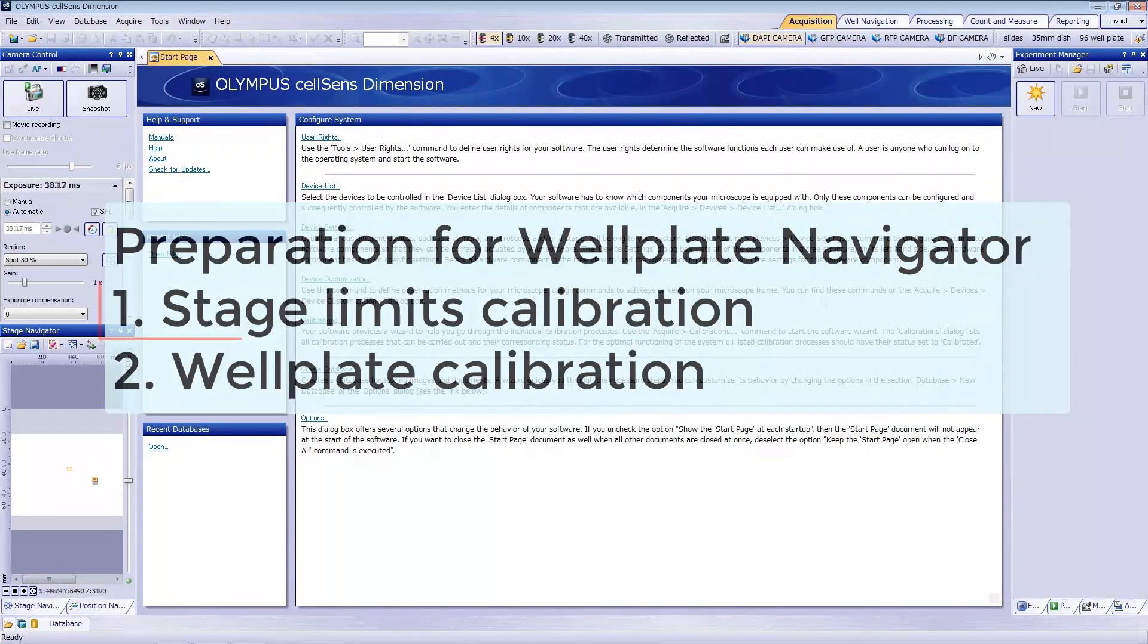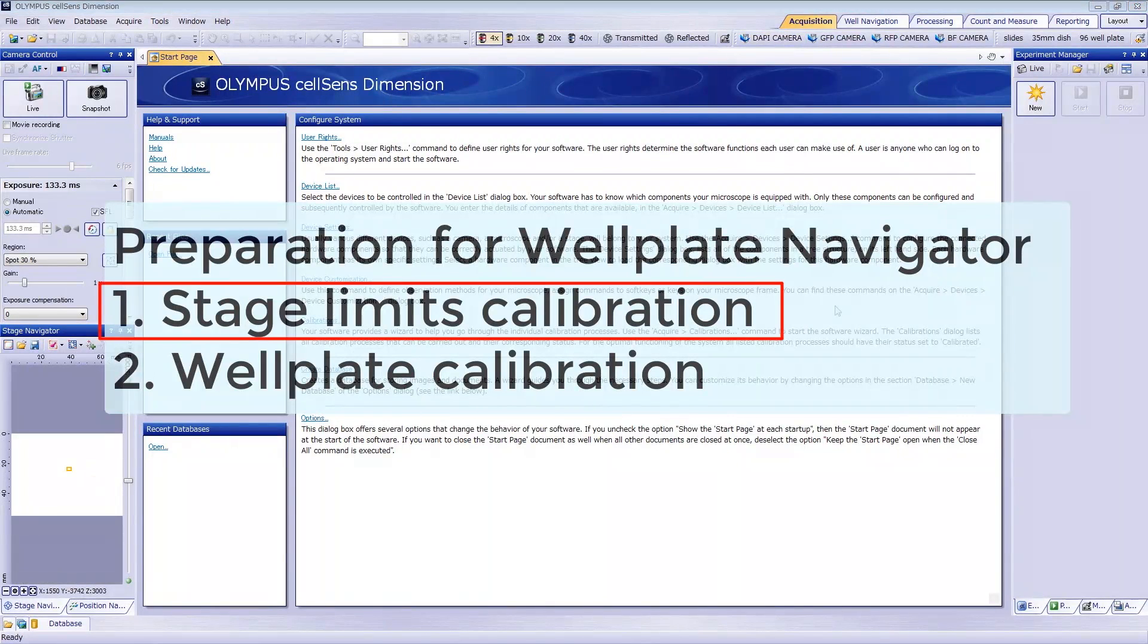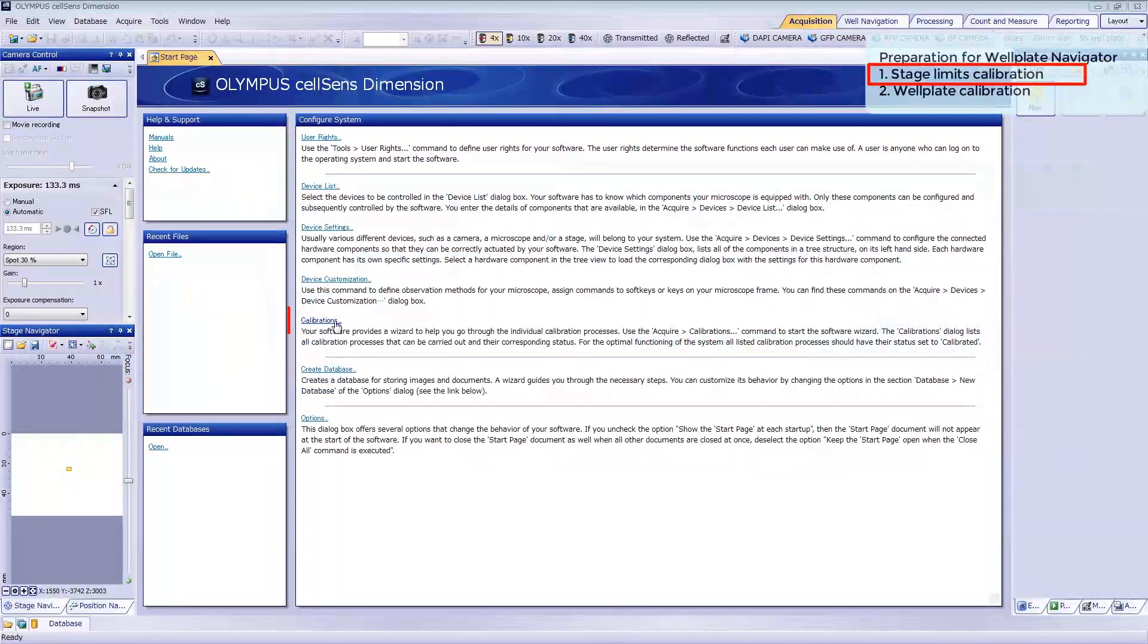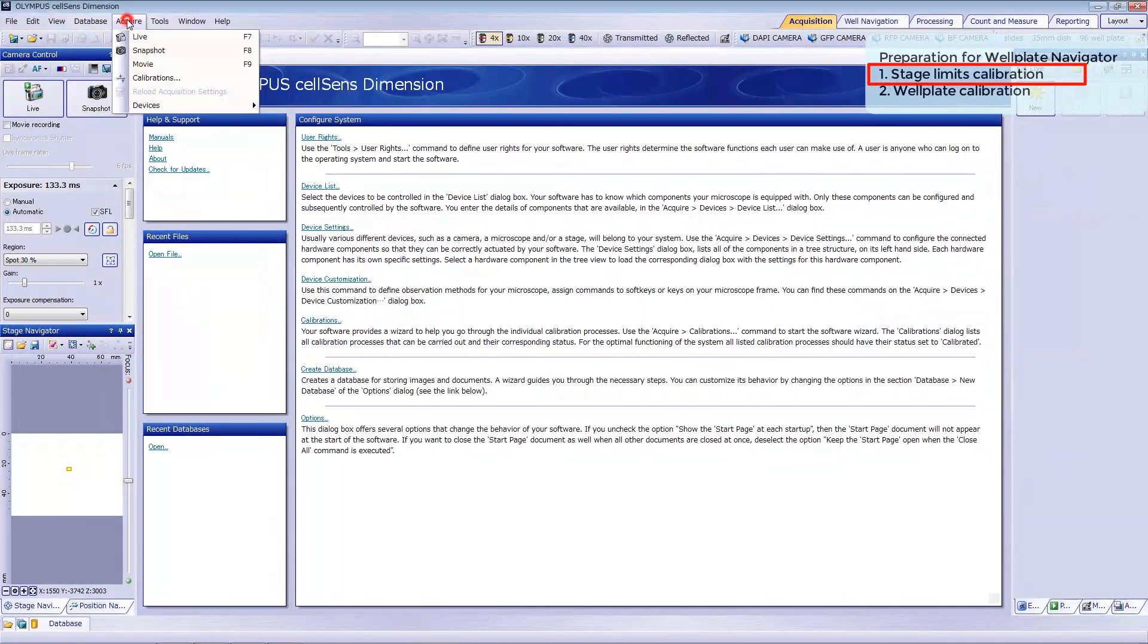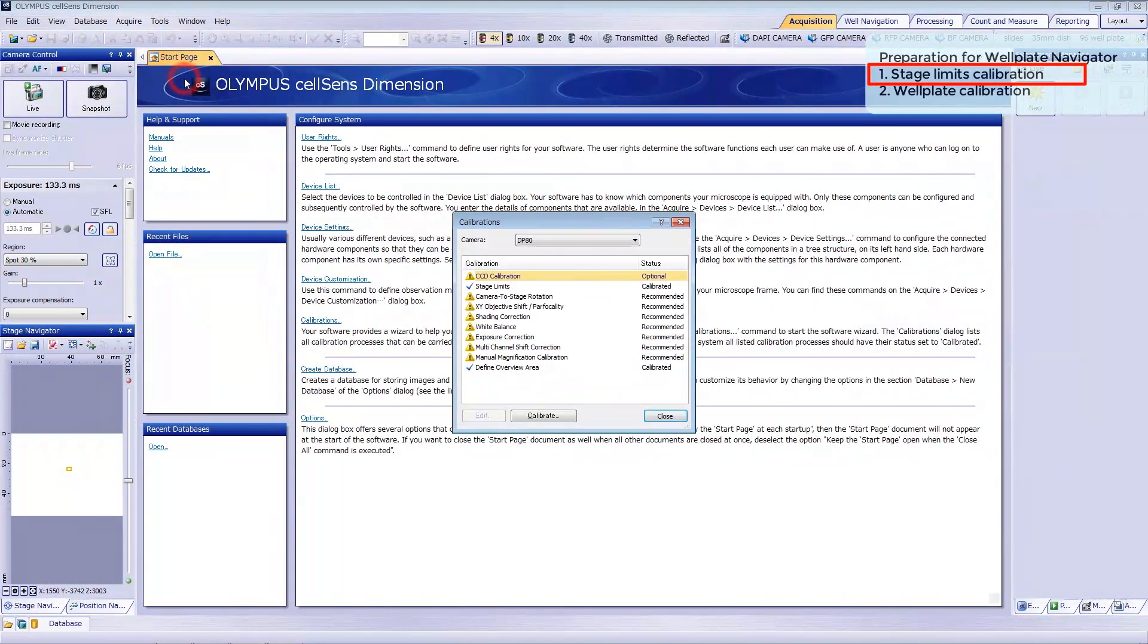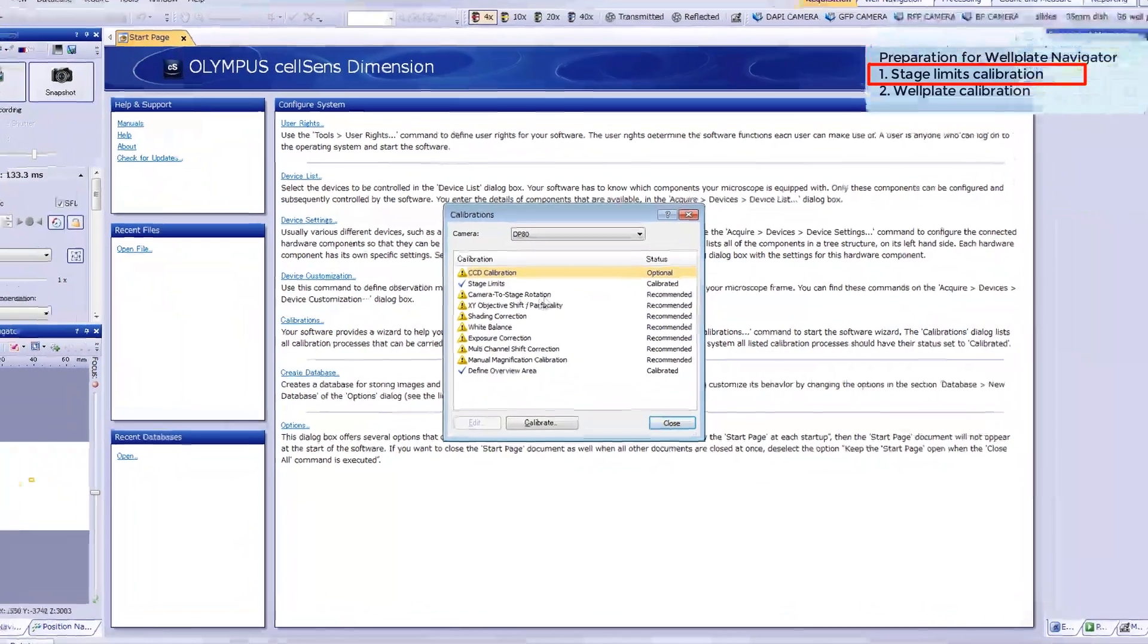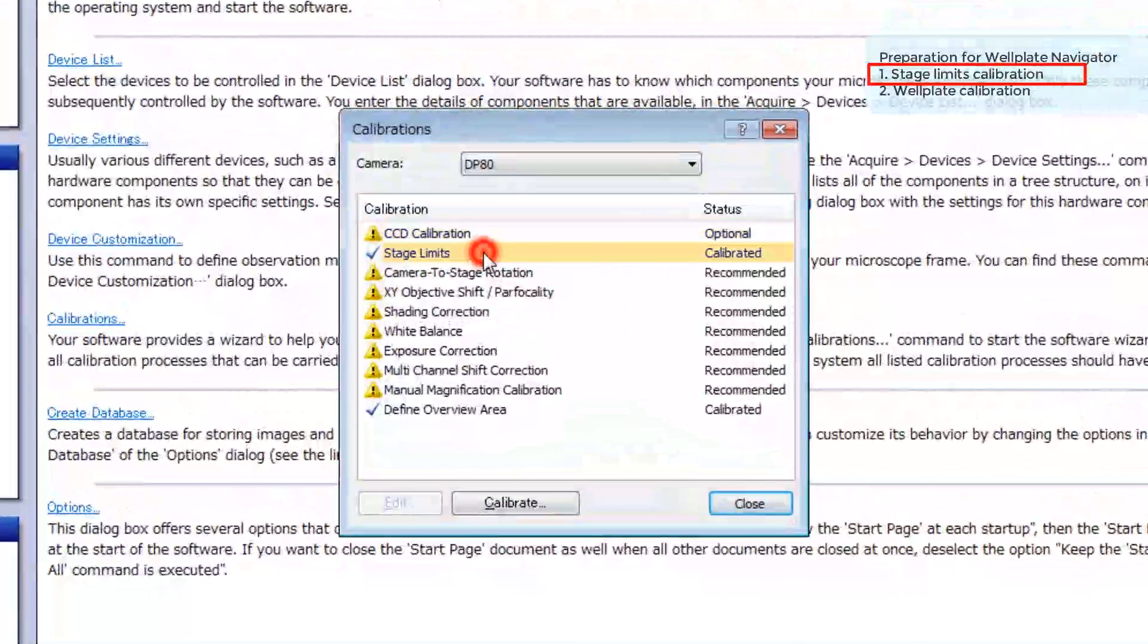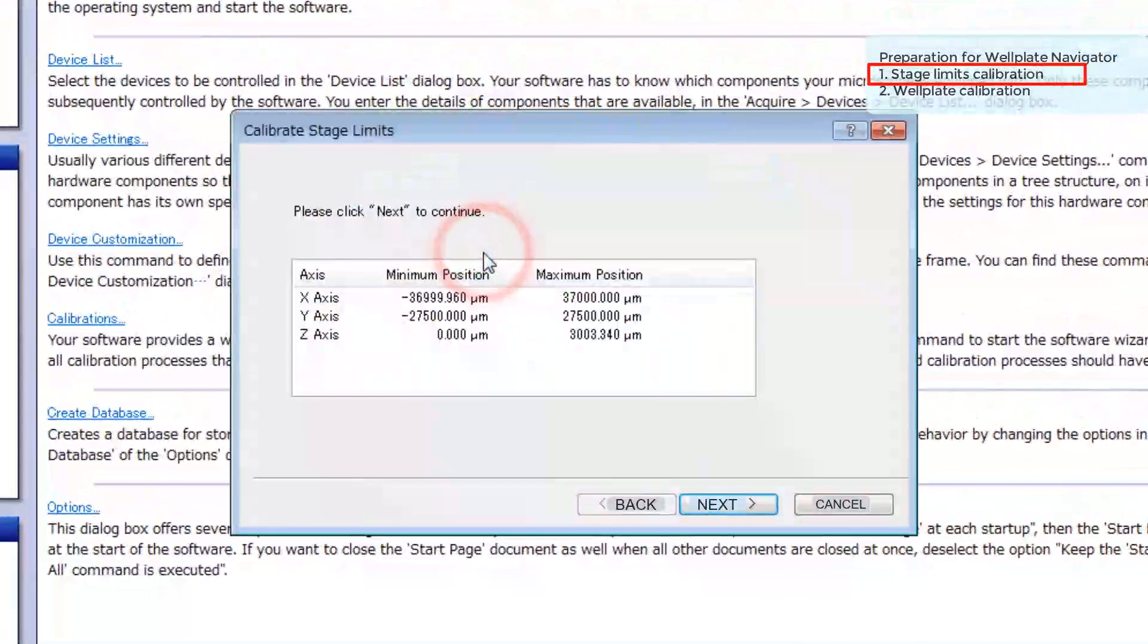First, set the stage limit calibration. Click Calibrations on the Start page or Acquire on the menu bar. Double-click Stage Limits, then click Next.